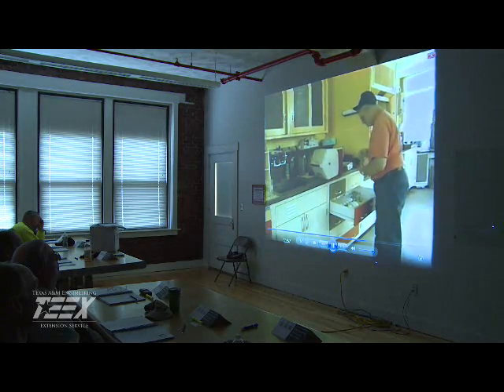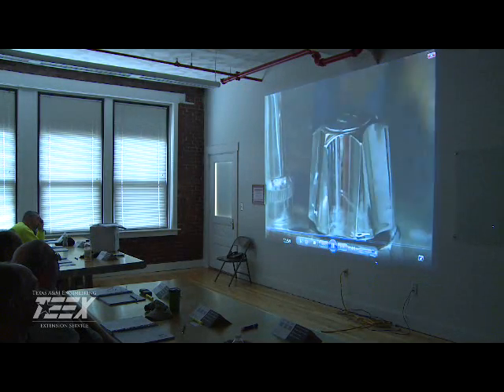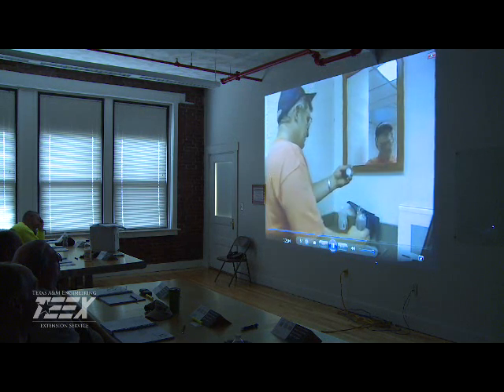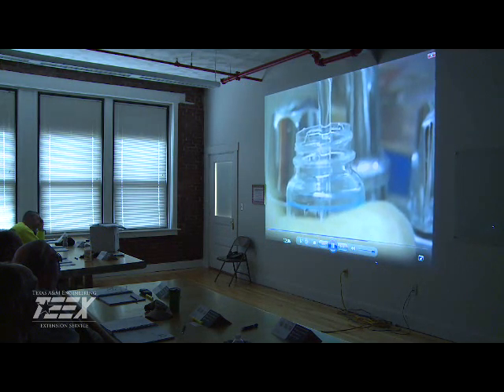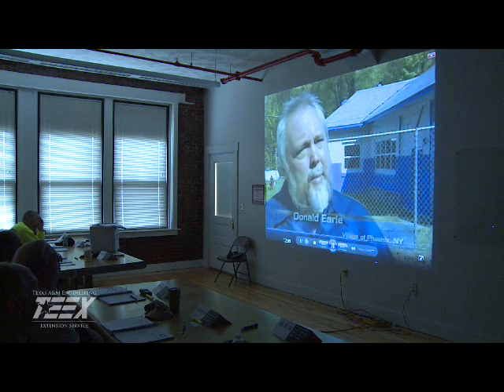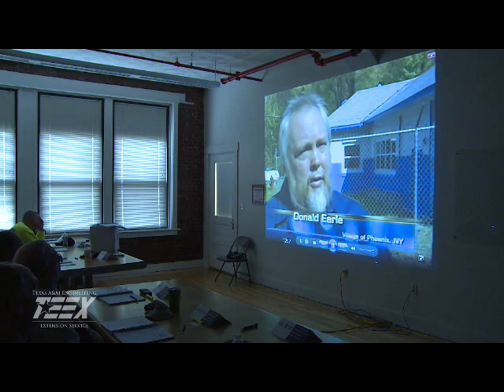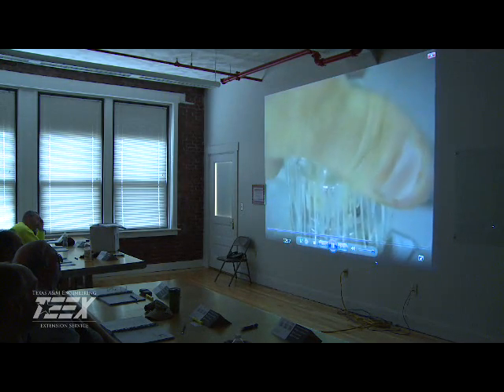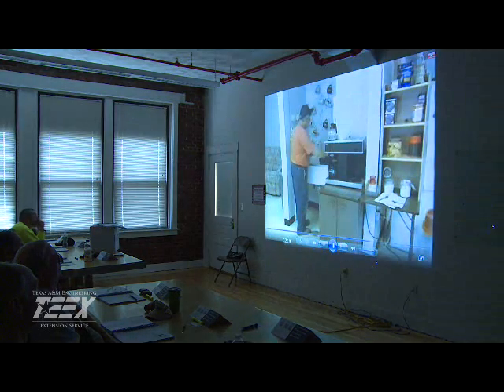They were poorly maintained, and they probably contaminated some samples. The water may not be bad, but the instrument it comes out of could be dirty, and it'll give you a positive reading in a heartbeat. You have to resample, it takes a lot of extra time and money, and if you get too many of them, it leads to a lack of confidence in your system and in your operators.